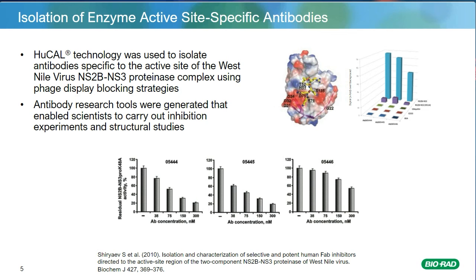Using our in vitro system is advantageous because it allows us to use stringent blocking, as shown by this example and the one in the previous slide. And generating highly specific, high-affinity antibodies that bind the native conformation of target proteins is something that's very difficult to achieve in an in vivo method.